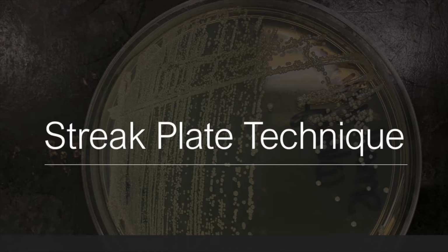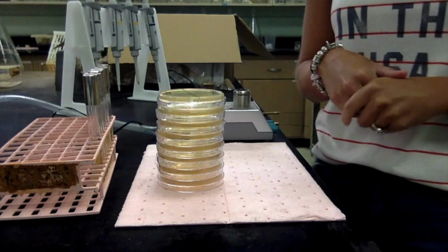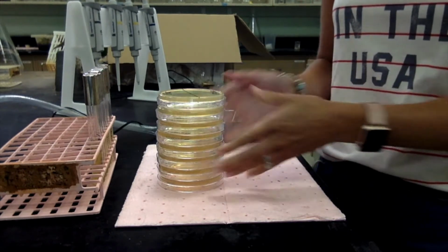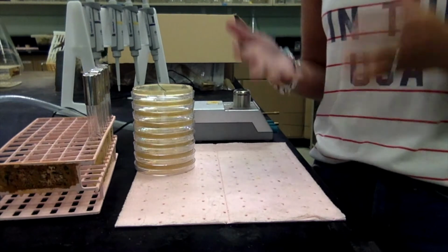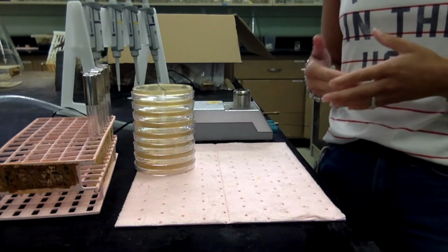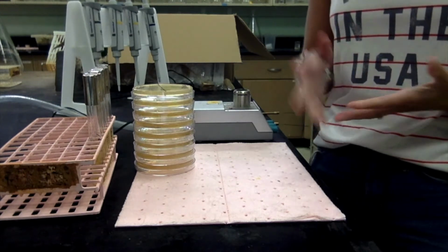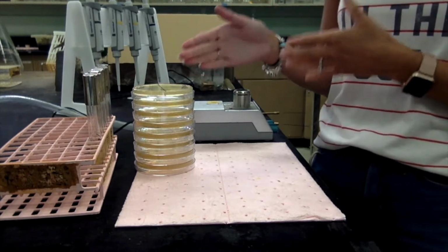Hi class, we are back in the lab today and I'm going to give you a brief explanation of how to make a streak plate. Now, there really is no lecture that goes with this because the streak plate is a technique that we learn how to do, and then you can do a streak plate on any kind of media that's in a plate.